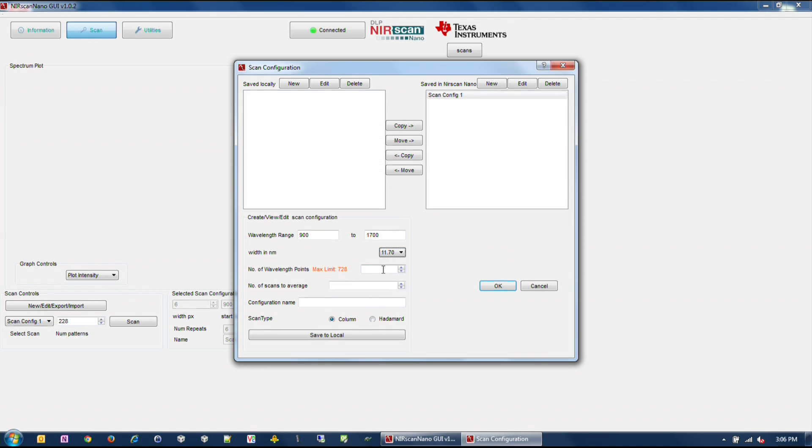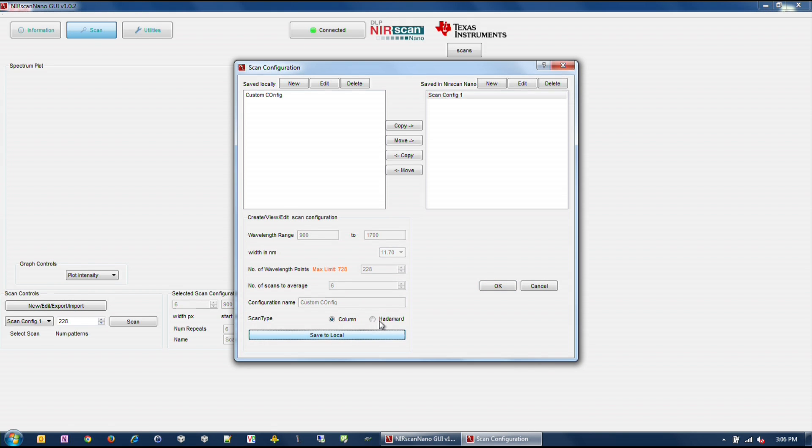Enter the desired number of wavelength points captured across the spectral range. Enter the number of scans to average for corresponding back-to-back measurements. Enter a configuration name and click Save. Close the Scan Configuration dialog box by clicking OK.